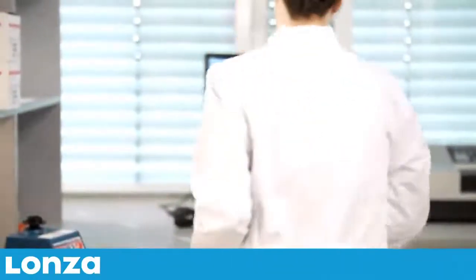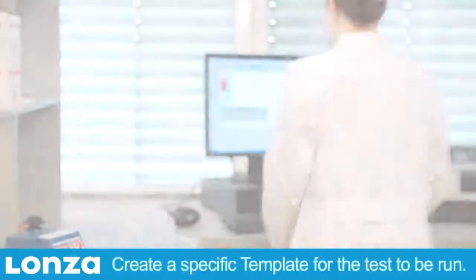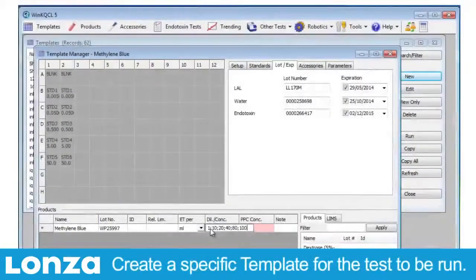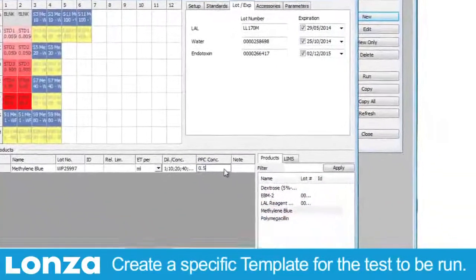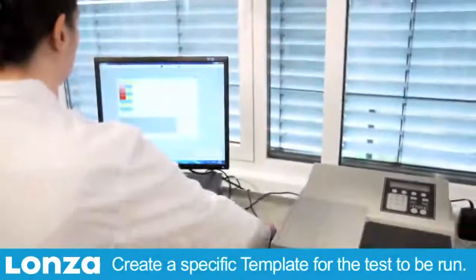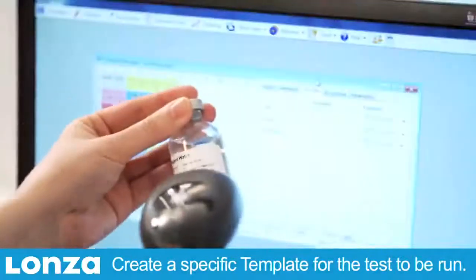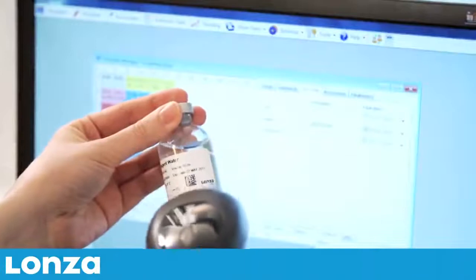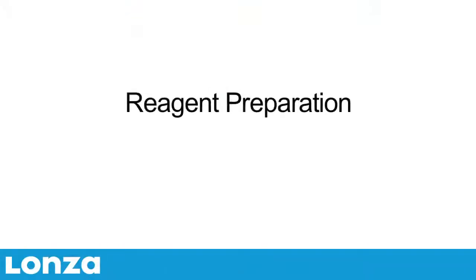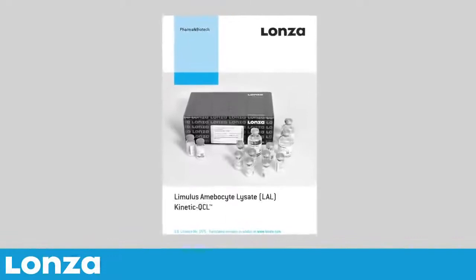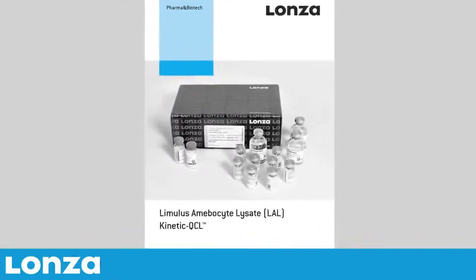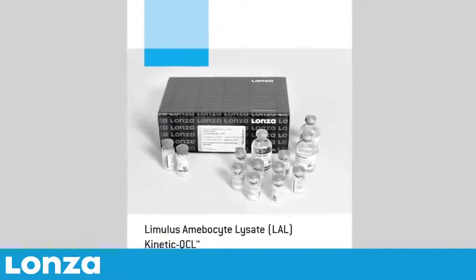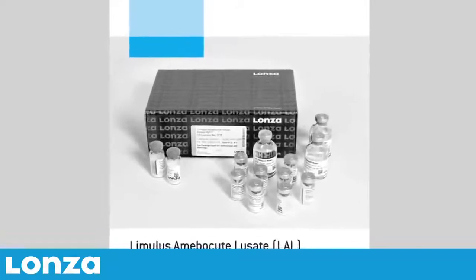Start by creating a specific template for the test to be run with our WinKQCL software. The software is designed such that it guides you intuitively through this setup process. The Kinetic QCL Assay Package Insert and Quick Guide provide complete, easy-to-follow instructions for performing the assay.